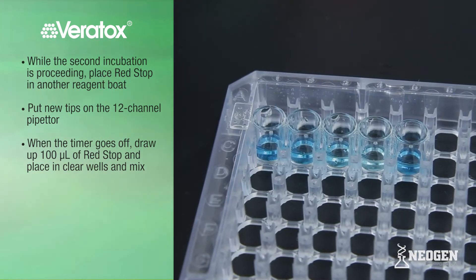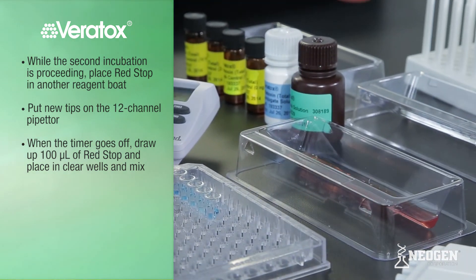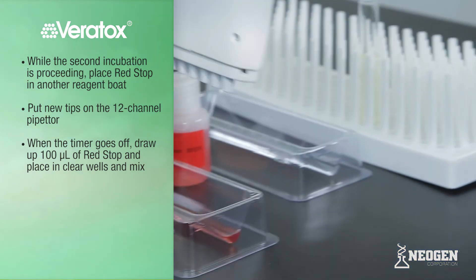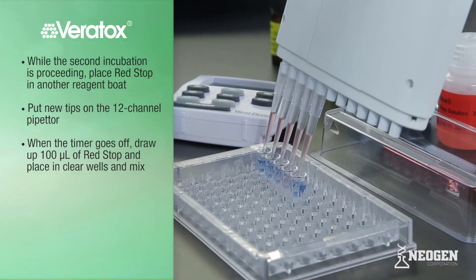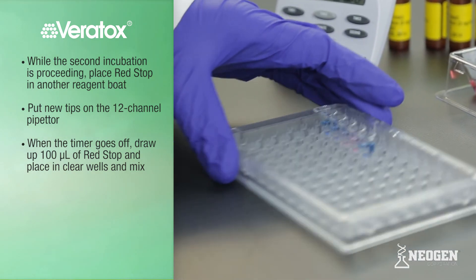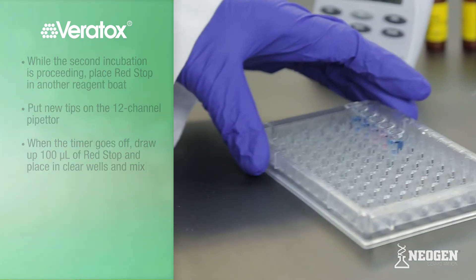The wells should change from clear to shades of blue. While the second incubation is proceeding, place the appropriate amount of red stop in a reagent boat and put new tips on the 12-channel pipetter. When the timer goes off, draw up 100 microliters of red stop and place in the clear wells. This stops the reaction and ends the test. Mix by sliding back and forth, ensuring that the liquid is homogeneous and there is no layering. Continue to mix if layering occurs.